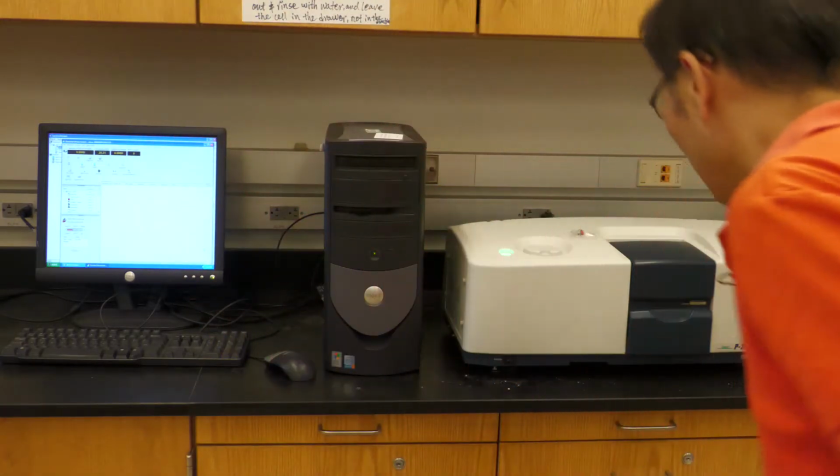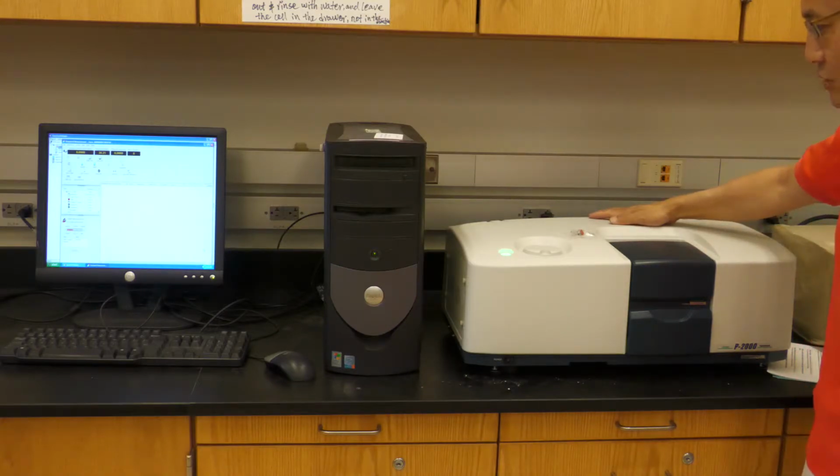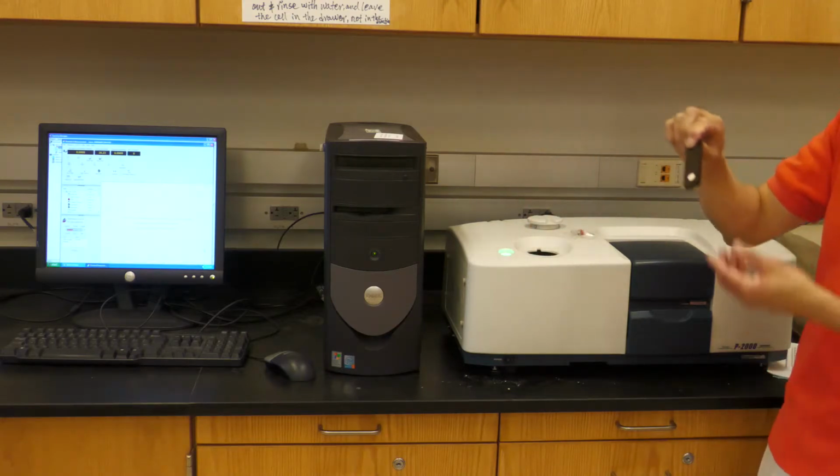From this angle difference, plus the stoichiometry, we can find the concentration change of your sucrose, how it decays with time. That is your experiment. Now that is a general idea. Your instrument will use this instrument. This instrument, you can see, we will use just one single light.